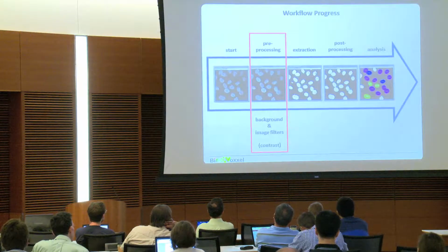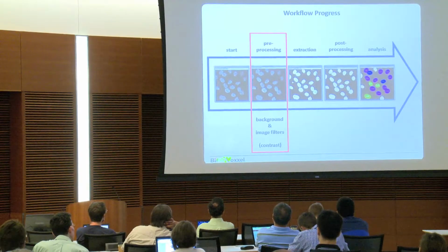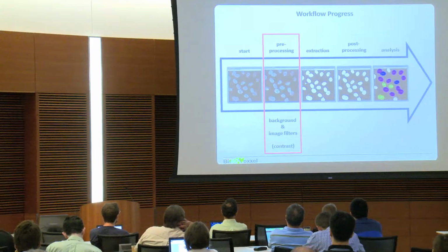So this is the workflow we want to go through. We normally start off with an original image, so sorry for a biological example here.